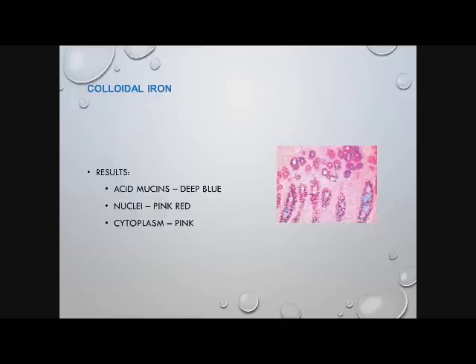You've got acid mucins looking deep blue. You've got your pink-red nuclei, and your cytoplasm is pink. It's really a very pretty stain.